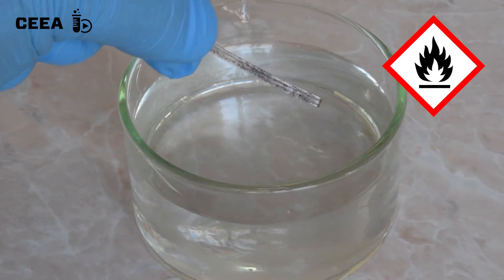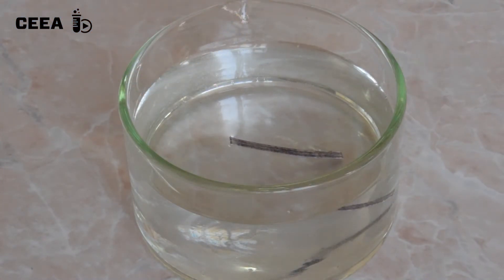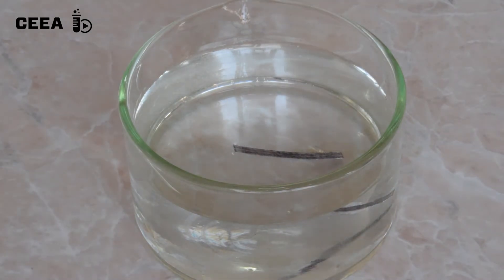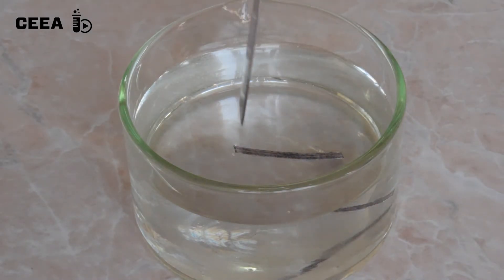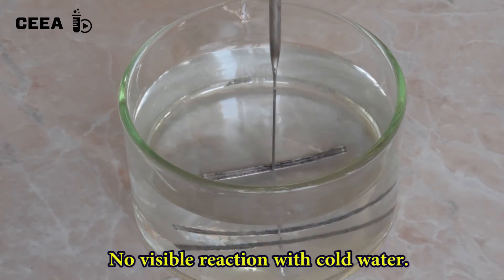Repeat the procedure, this time with a magnesium plate in cold water. Observe that no reaction is seen.